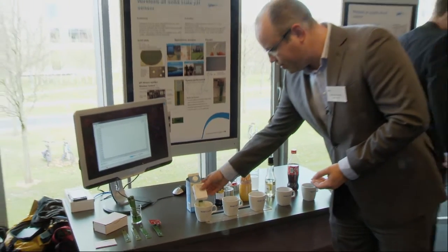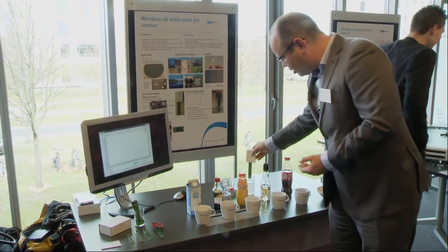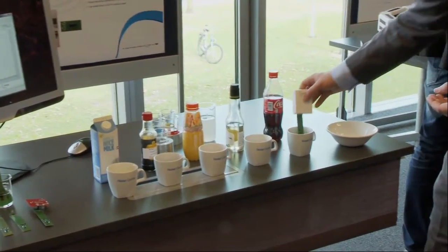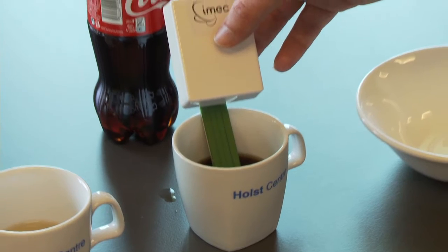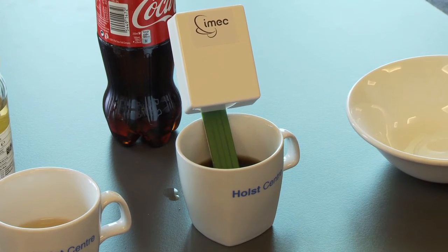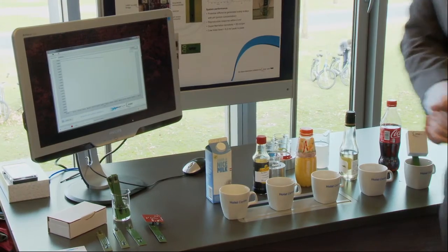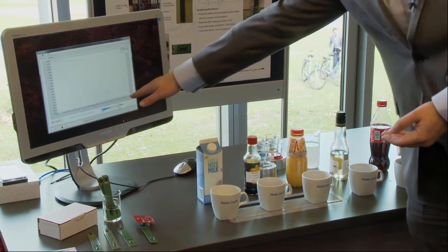In contrast, when I immerse the sensor in coke or in any fizzy drink, this fluid is quite acidic, having a pH of only 2.8.